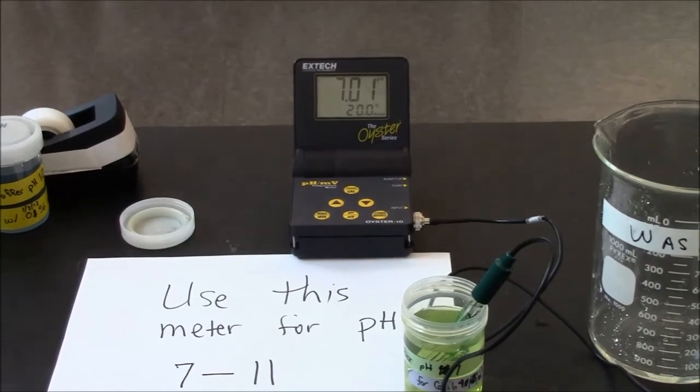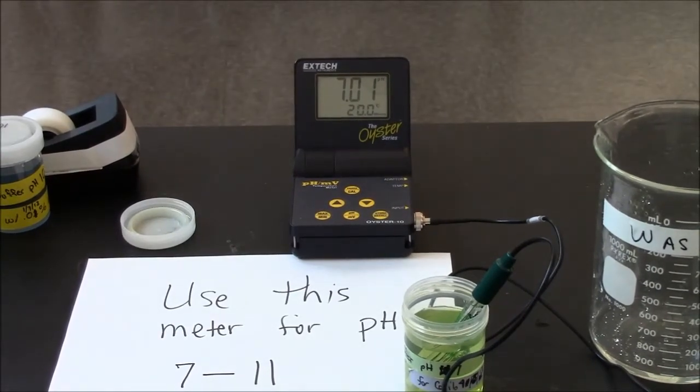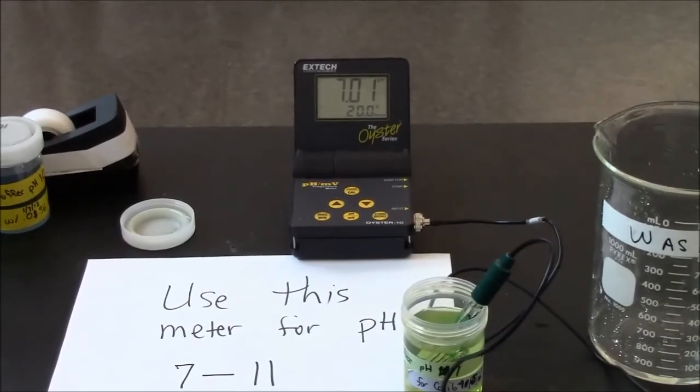When you get to the titration phase, your pH measurement doesn't have to be precise. So at that stage, think speed is more important than accuracy and swirl it, get a reading, go back and titrate some more.